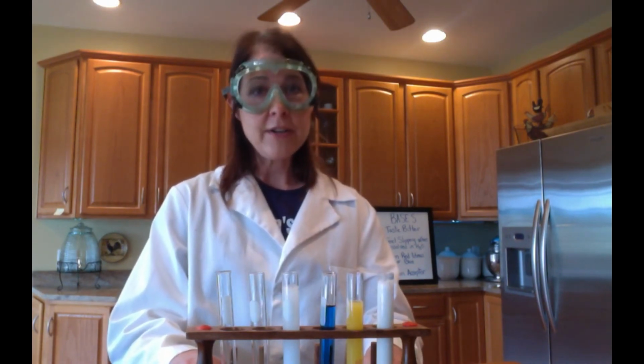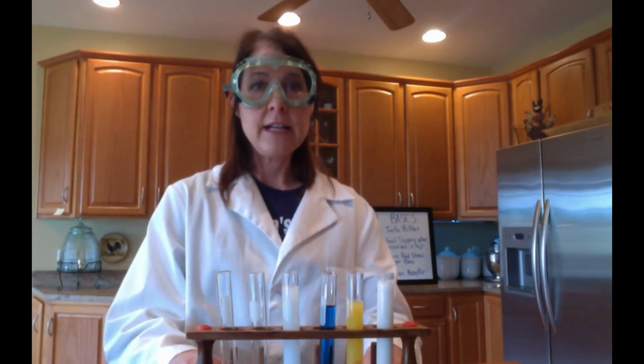On our next lab, we'll be looking at how you can use an indicator to find out how strong or weak an acid is and how strong or weak a base is.